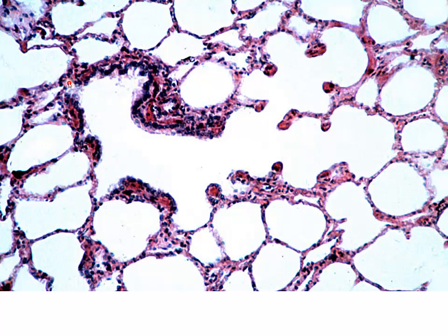Now this one's kind of close because if that is actually a passageway leading to an alveolus, then we would have to also call this respiratory. But if we could look back even further and just see this continuous wall, this continuous uninterrupted mucosa, that would then be a terminal bronchiole that leads to and is adjacent to the respiratory bronchiole. And that's what we're looking at.